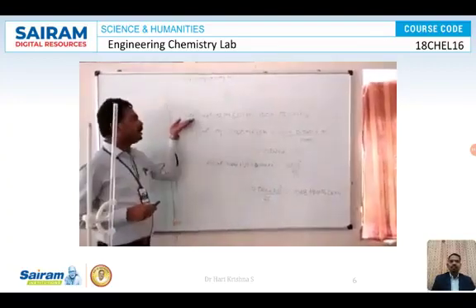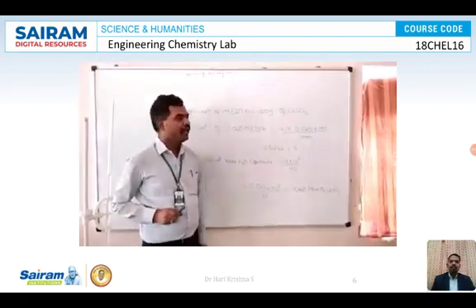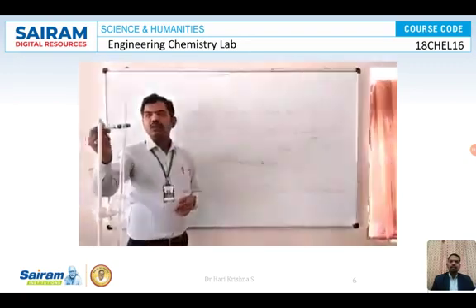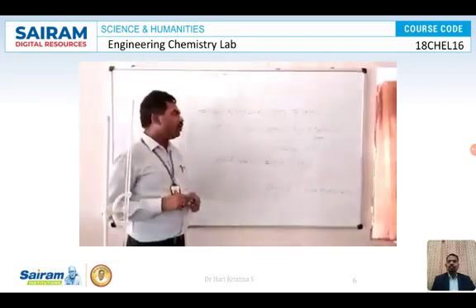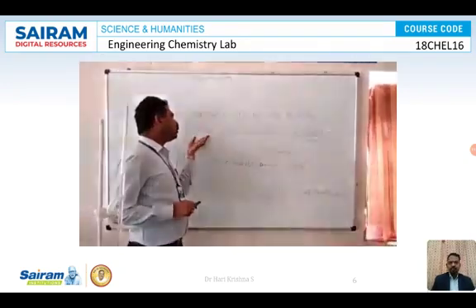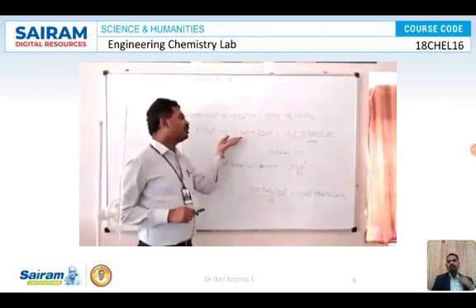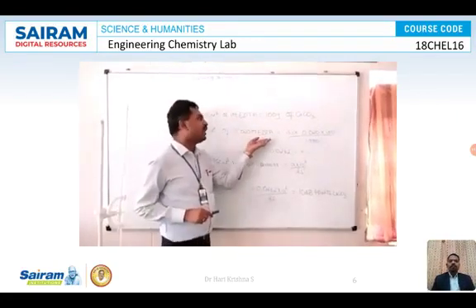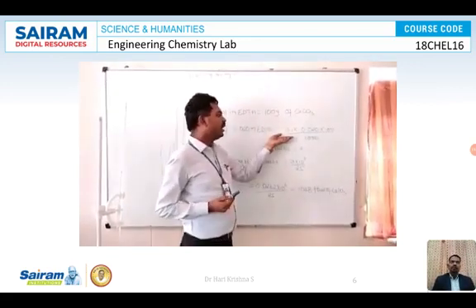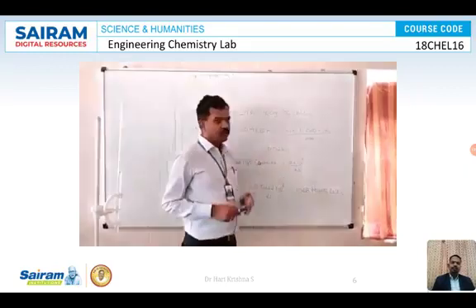So 1000 cm³ of 1 molar EDTA contains 100 grams of calcium carbonate. For X cm³, meaning the volume of Na2EDTA run down, which was 13.1 cm³, the molarity of EDTA was found to be 0.020 molar. So how much calcium carbonate does it contain? Cross multiplying, it is 13.1 into 0.020 into 100 divided by 1000.